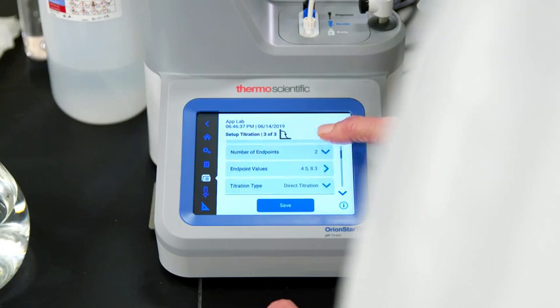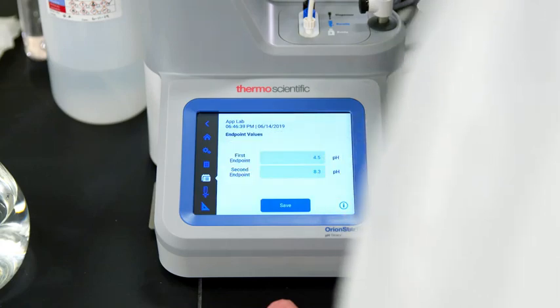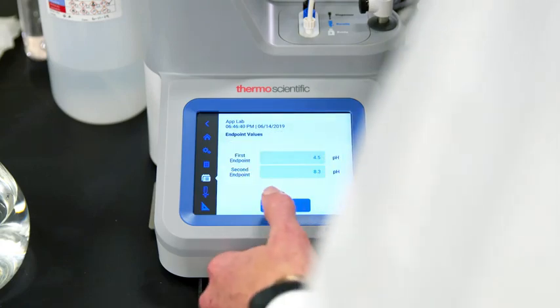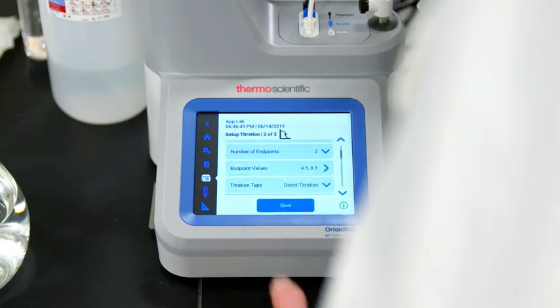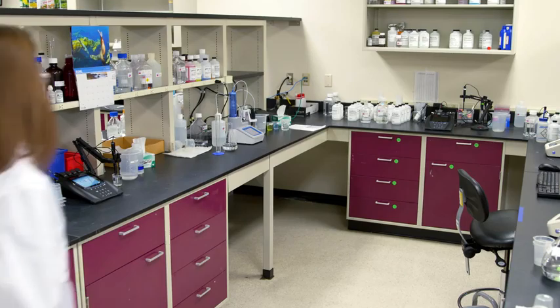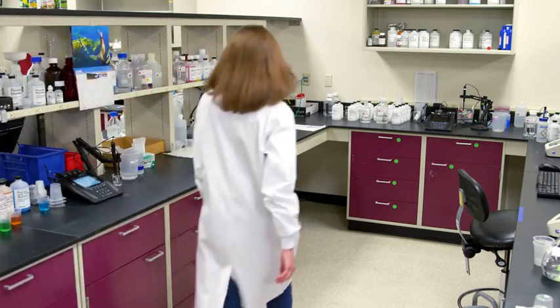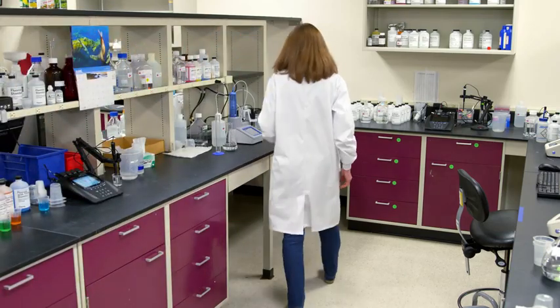You also have the option to modify the method, and we'll show that at the end of this video, so stay tuned. Let's get to work.